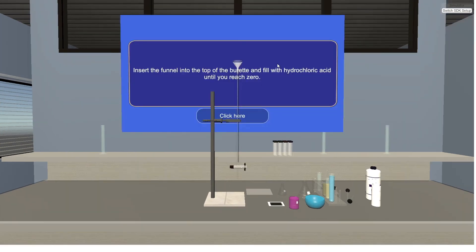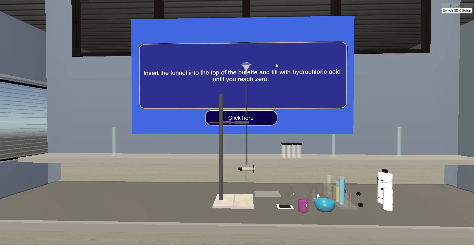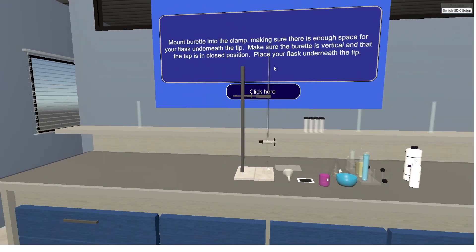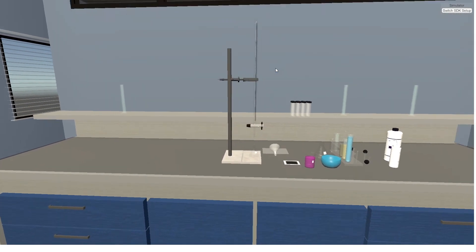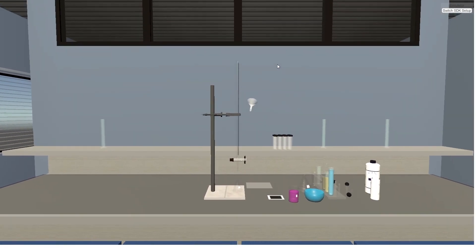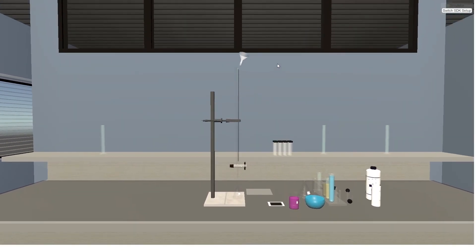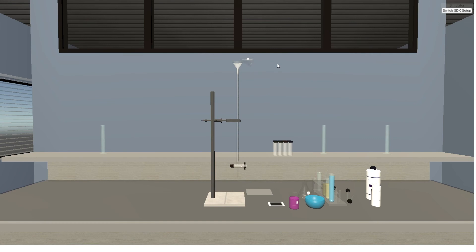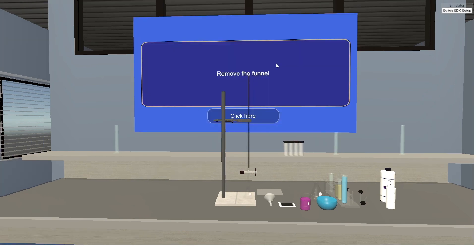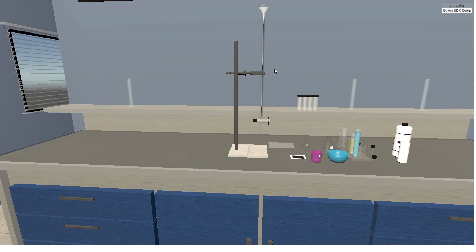Insert the funnel into the top of the burette and fill with hydrochloric acid until you reach zero. Remove the funnel.